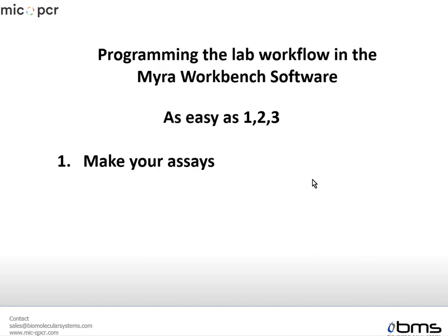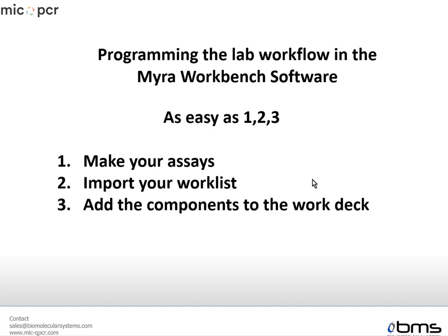So programming the lab workflow is as easy as 1, 2, 3. The first step is to make your assays. Secondly, import your work list. And finally, add the components to your work deck and start the run.